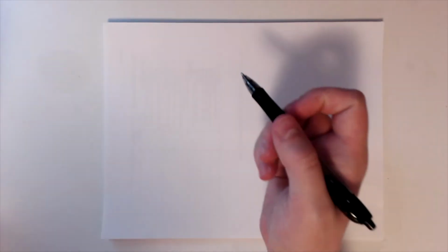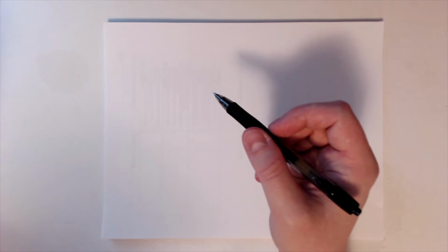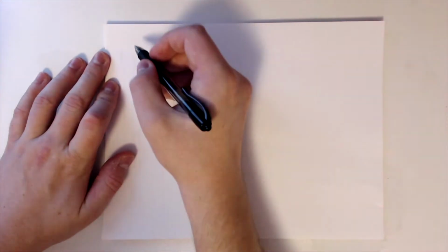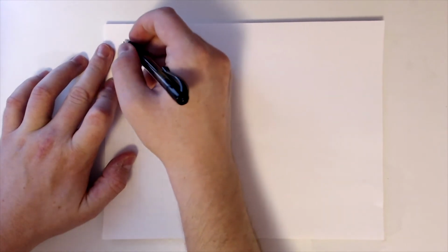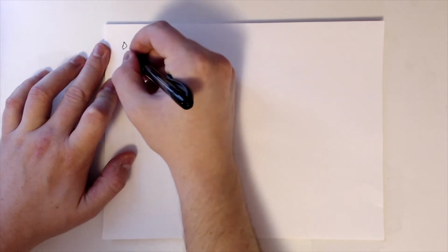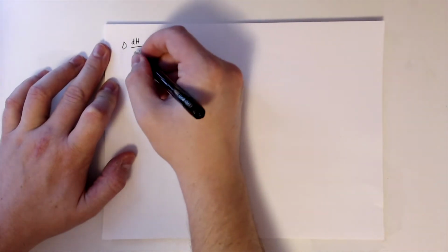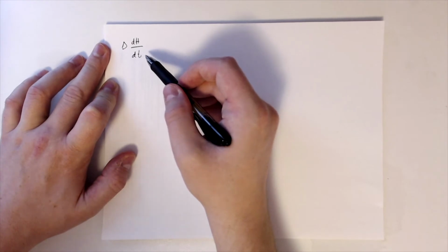Okay, so next, I've mentioned multiple times we have a sample versus a reference. And so it's important to define that as well. And since we're looking at enthalpy that we defined in the last part, we're looking at delta of the enthalpy change for each, right? So the large delta here is for the change in the heat flow, which we've defined as enthalpy over time.